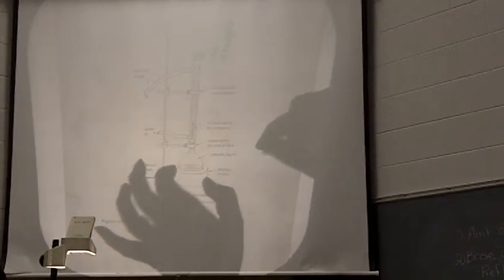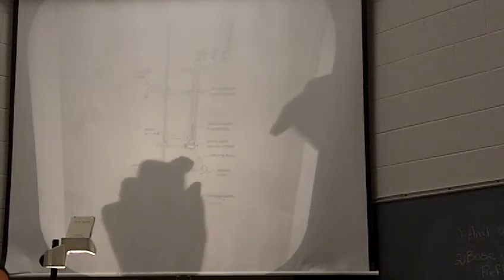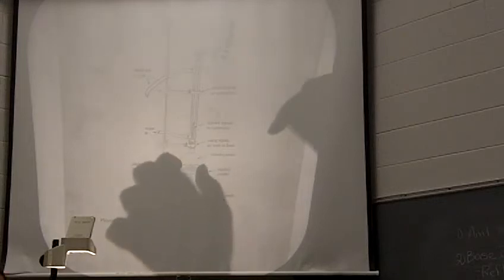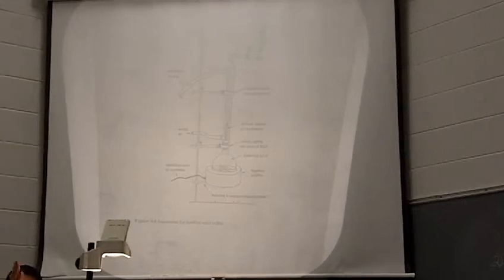Then you will be using the heating mantle. You have not used those before. And then you will put your 100 milliliter round bottom flask that it tells you to use, with your trimyristin in it, and your ethanol and your sodium hydroxide in here, and a stir bar, okay? And then you want to clamp that flask so that it's sitting well, sitting down in the heating mantle, and make sure that the neck is nice and vertical, okay?